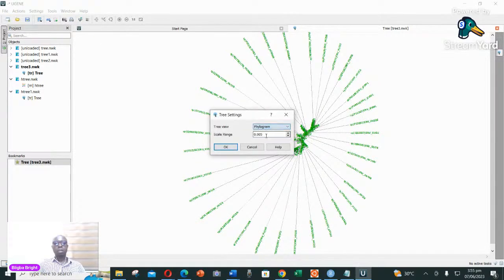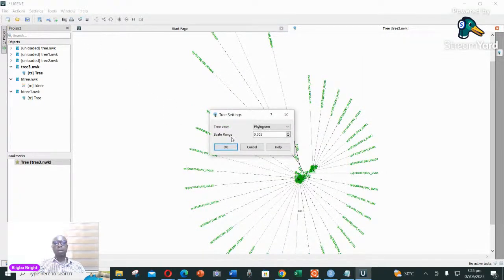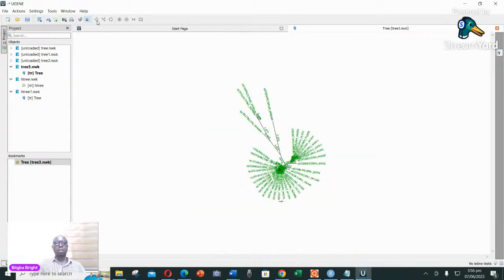Well, so here what is now left is for you to do your manipulations, and then you are able to get exactly what you want. Okay, I'm going to cancel this. Yeah, so you can just use the phylogram to get your phylogenetic tree, and then you can also use the cladogram to get your clustering. And of course, if you are also interested in your alignment, then the alignment is also there for you. This is basically how we are able to do it.